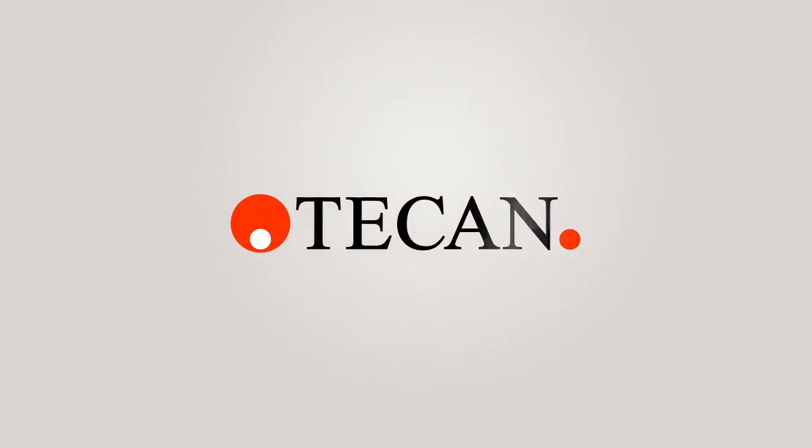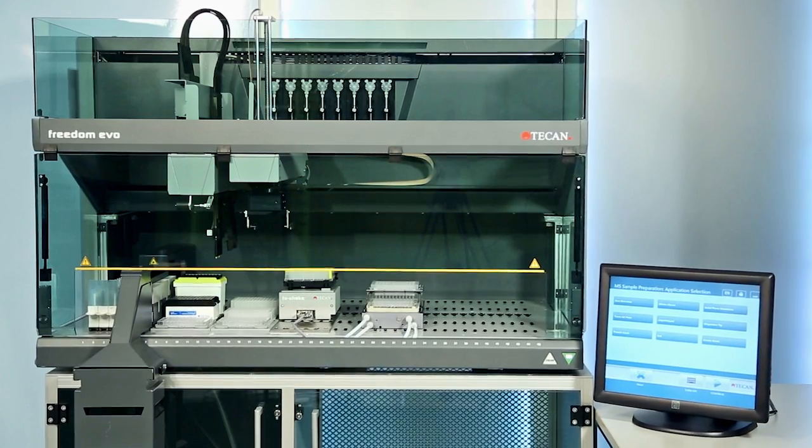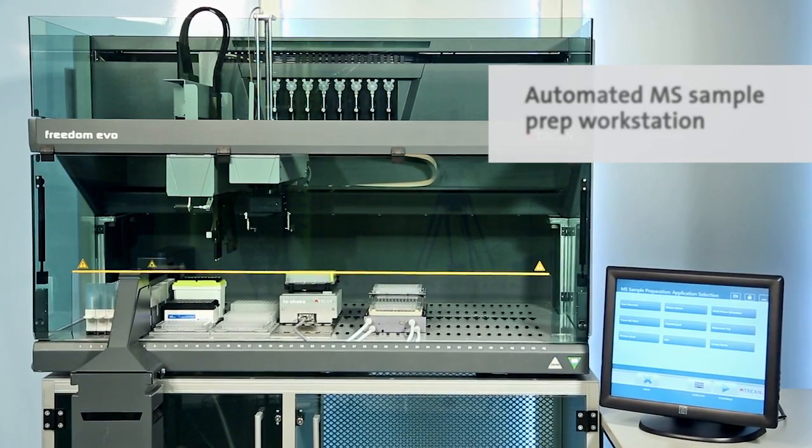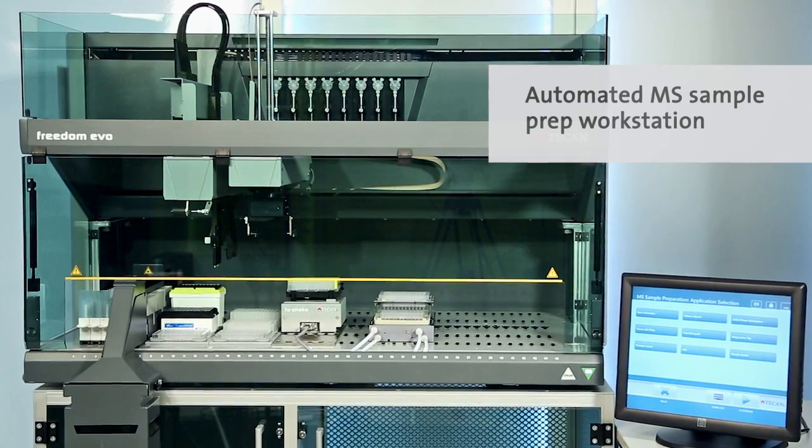Have you had enough of tedious MS sample preparation? TCAN offers a breakthrough automated sample prep workstation, combining years of liquid handling expertise with in-depth understanding of your applications.